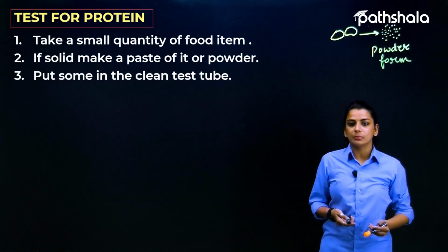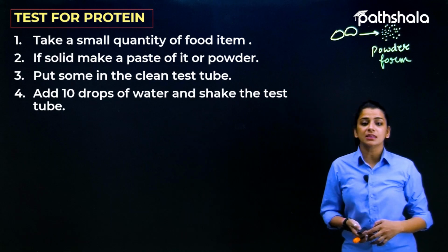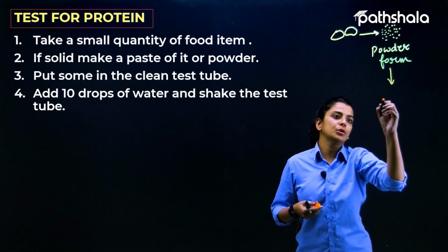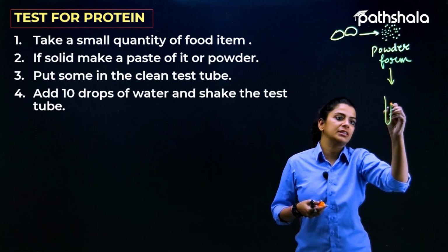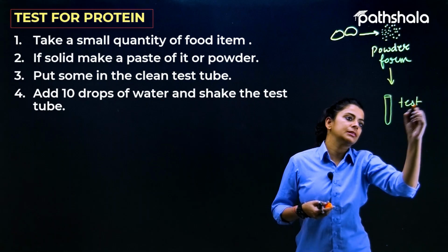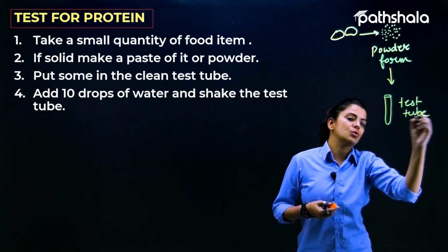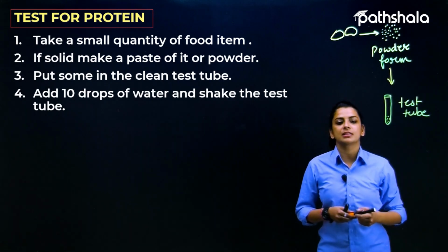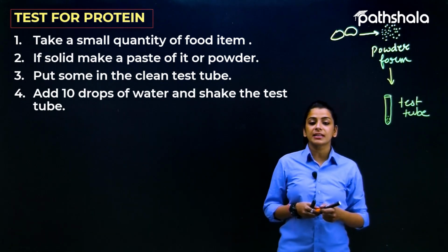Now, next will be put some in the clean test tube. अब आपने क्या करना है next? You have to put this food material into one clean test tube. This will be the test tube, right? And you have to put this food item inside the test tube.